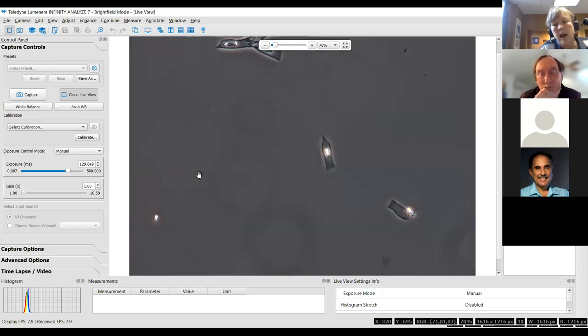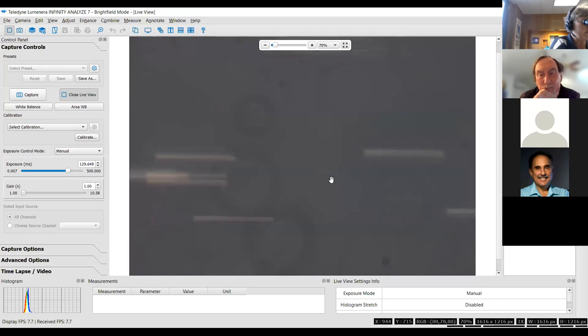It's hard. I have seen preserved ones. In this one, you can actually see one of the flagella that comes out. I often do not see flagella in Dinobryon unless it's freshly preserved.